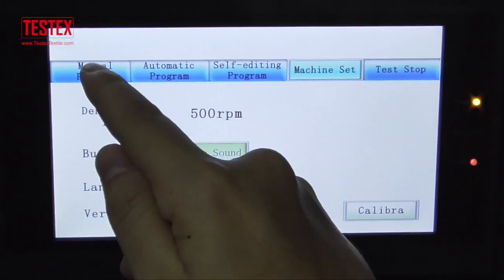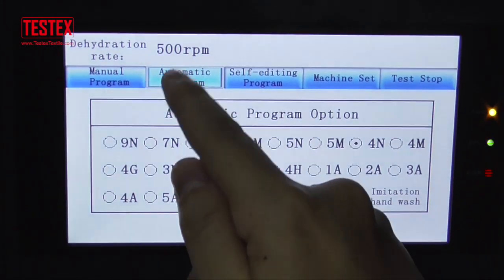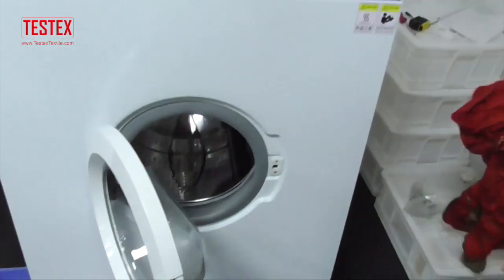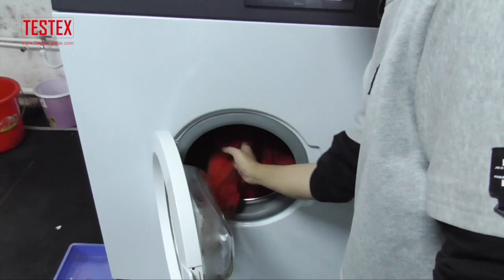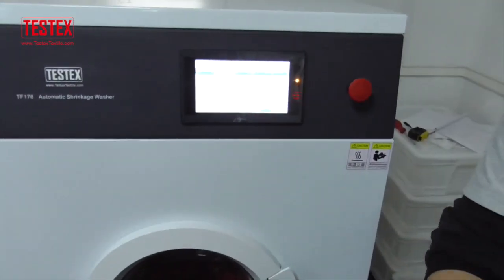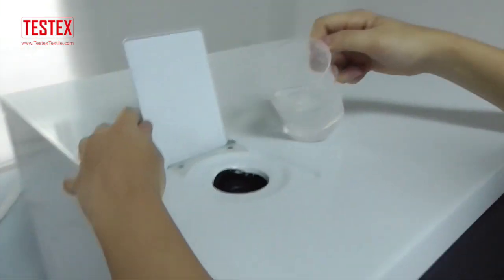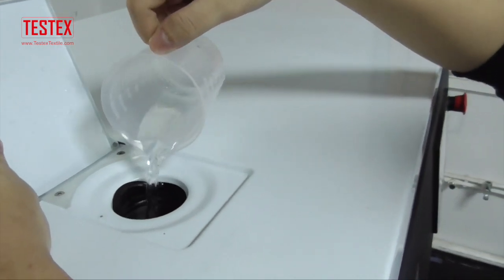And turn it. We are testing the station — we need to use this one. And sleep the scene. And turn it off and put the sample on it, and see how that works on here.